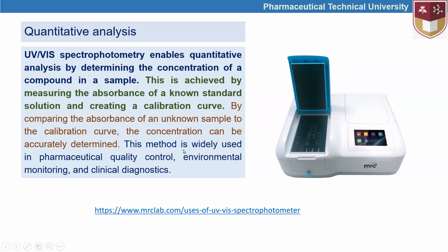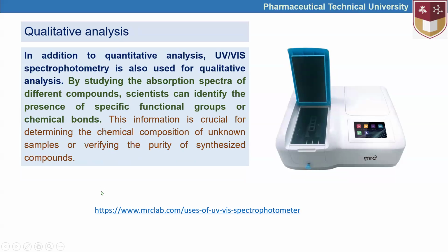Again, based on the similarity to some expected compounds and the calibration curve that was developed based on that expected compound, it is possible to identify and to quantify that compound in the given samples.